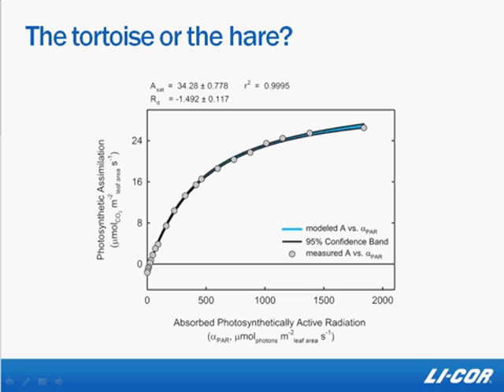Fast light response curves allow you to do many curves in a single day, but the stomatal conductance values at the lower end of the curve are often too large because the stomatal processes haven't fully acclimated to the light level they're experiencing. Many things in the plant happen on different scales, and so we might find that one thing was stable, but another thing was not quite where it would be if it was at true equilibrium.